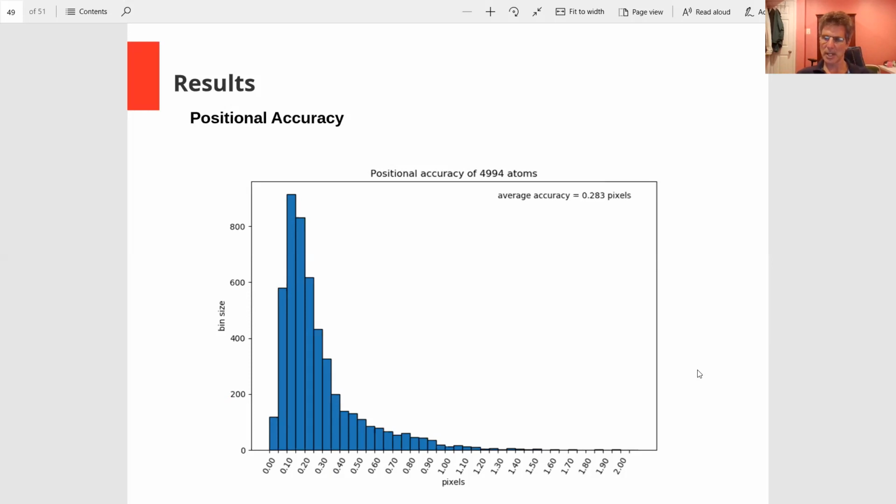I'm taking a set of 10 atoms and comparing it to the true atoms. And if the comparison is just horrible, then I'm saying, okay, let's not compare that set of 10 atoms, let's compare the other set of 10 atoms. So this is kind of like an idealized case. It's as if I know which set of 10 atoms is correct, even though I don't know which set of 10 atoms is correct. And then I do that test for positional accuracy.